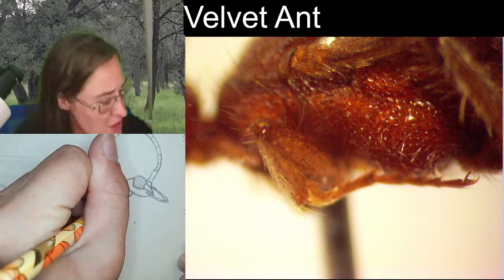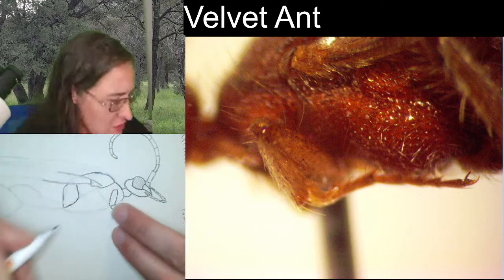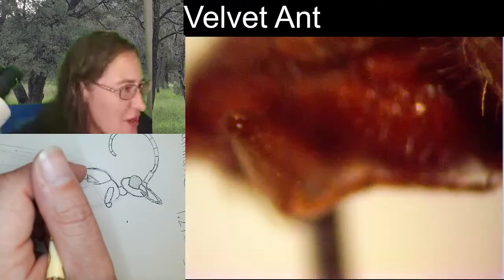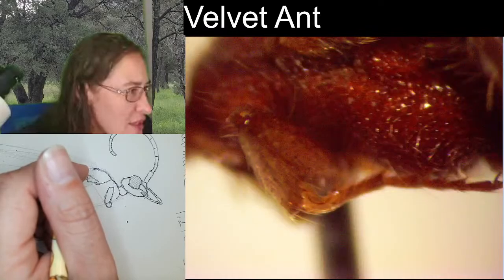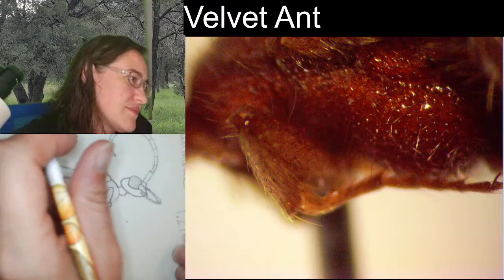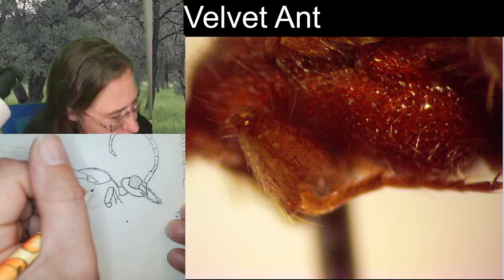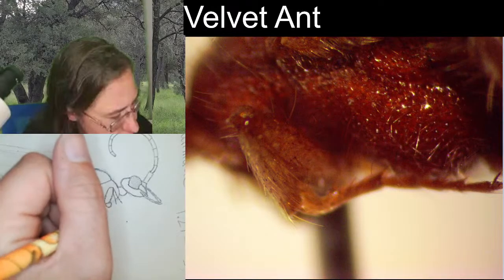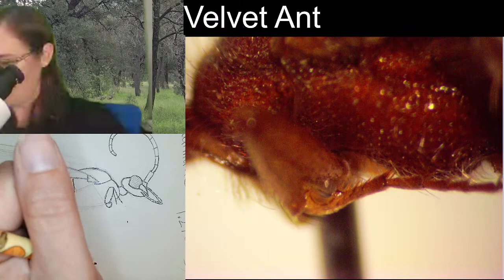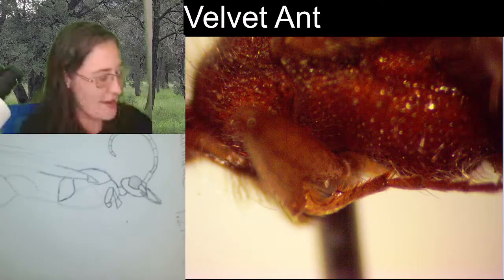So if I come here and I create this, it kind of gets a little bit wider in the middle. Just arches out just a little bit. We've got that femur that comes up. We have the tibia that goes down, and the tibia does end at an angle, I'm seeing. So my question is, if it was walking in the proper direction, the angle is going to be wider on the back than at the front.